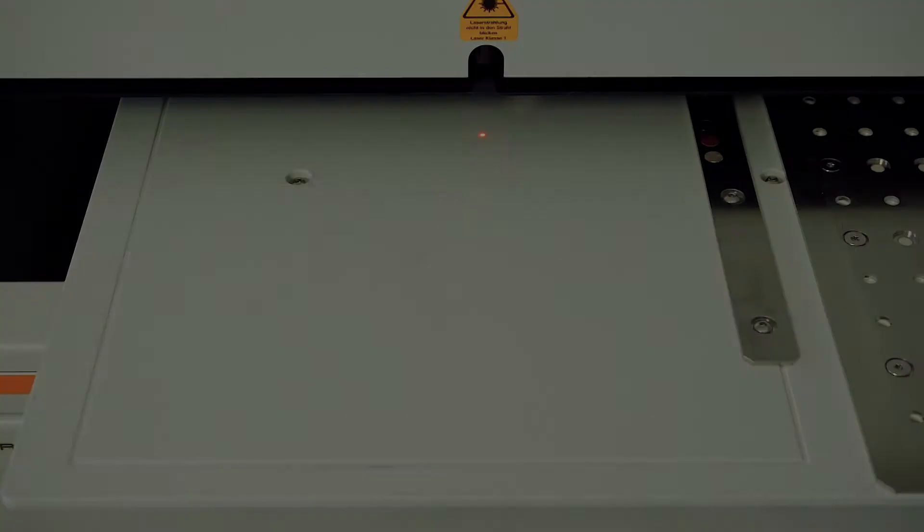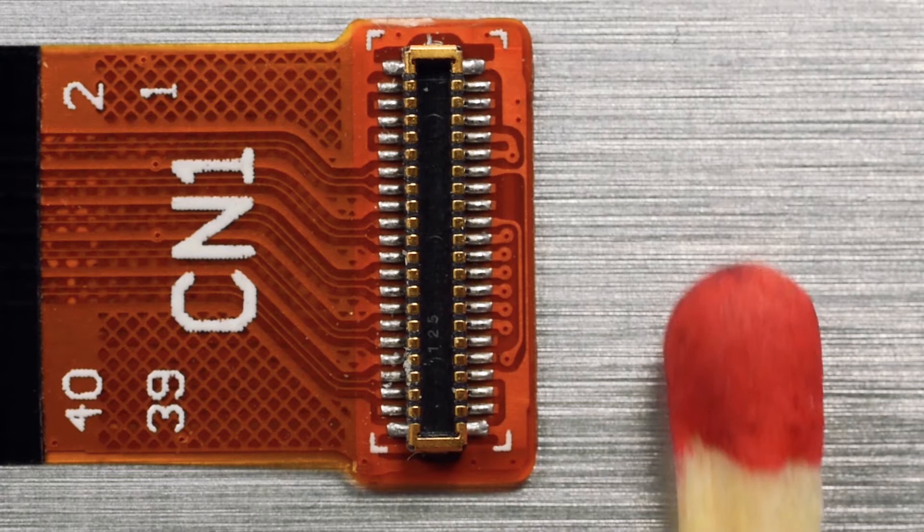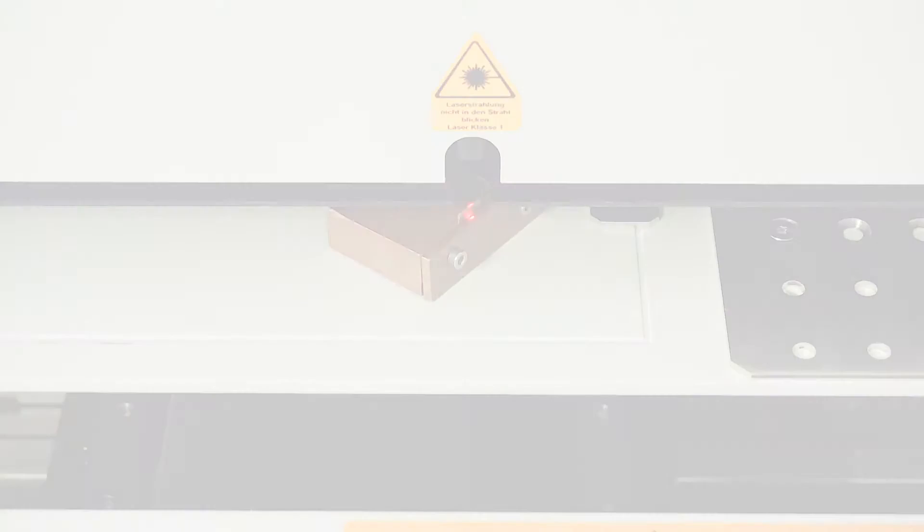Here we are measuring a sample used in millions of cell phones, gold and nickel plated copper tin plug contacts.